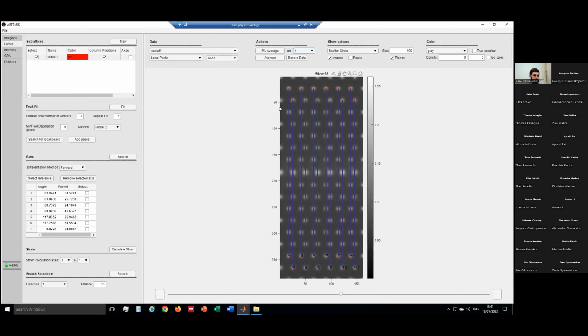So in our material, we have to check the one with the four plane, and the one with the 7. As you can see, they are the groups, these groups. So the other axes are deleted. And we have only the chosen axis, this one and this one. Actually, now we have groups of atoms.